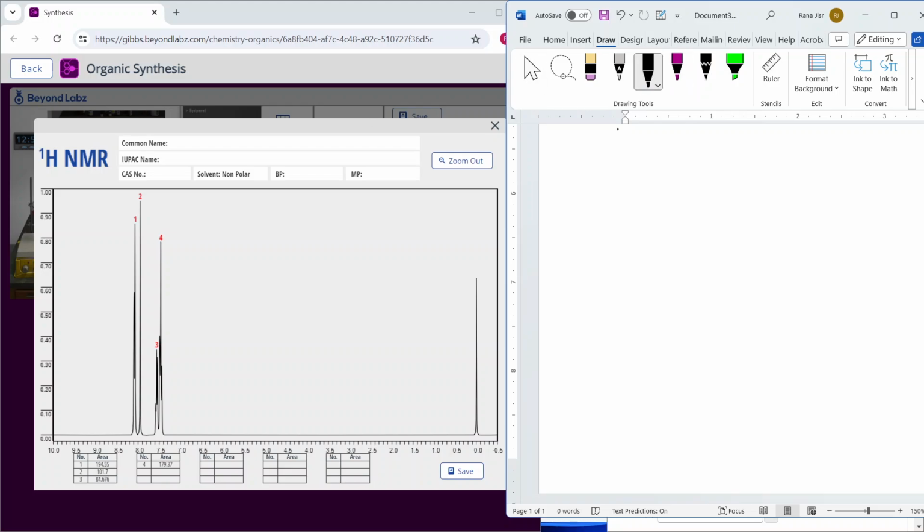So I know, draw the structure of the product, which is the benzoic acid in there. And if I look at the structure, if I want to analyze how many proton NMR signals I have, these are the signals. Every different hydrogen will show a signal in the proton NMR.